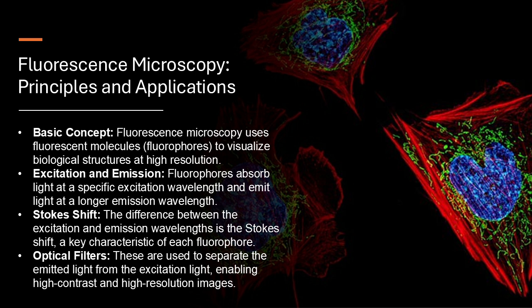We can now study the organization of proteins within cell membranes, track the movement of single molecules in real time, and even watch how viruses assemble inside cells. That's amazing. It's like opening up a whole new dimension of biological exploration. It's like we're zooming in further and further, revealing more and more detail with each new advancement. Exactly. It really makes you wonder what other mysteries are hidden within this microscopic world.